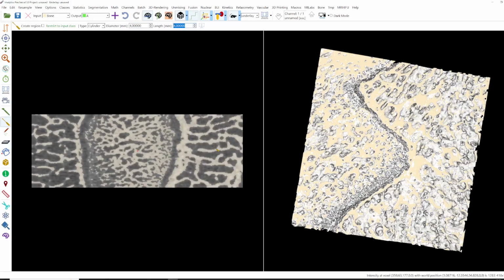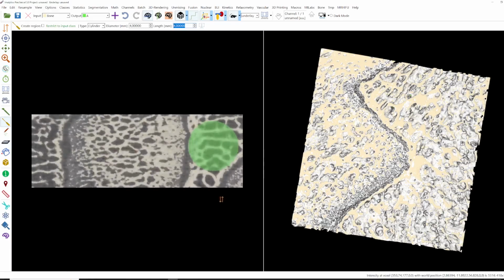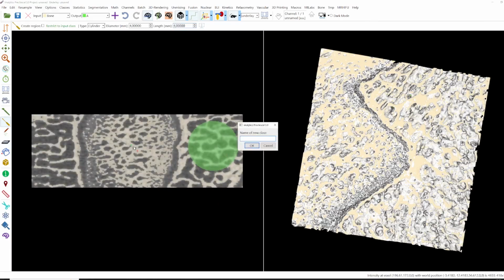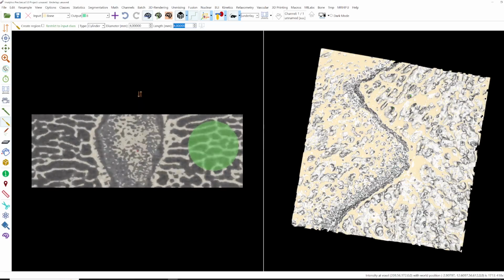I will place it here. Looks good. And I will place another one here. Call it B. Looks also very good.